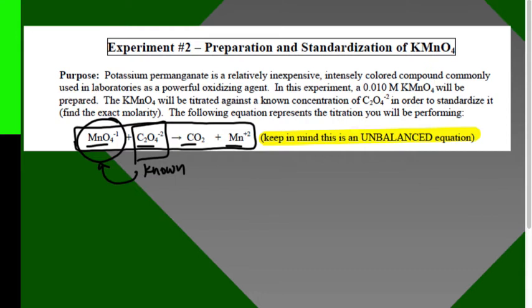In this titration, we have oxalate in a beaker that we've dissolved—a known amount of oxalate. In our burette we have our purple potassium permanganate. We're going to titrate the permanganate, and it's going to be weird because you're going to be putting purple in and it's going to turn clear. That's because the oxalate is going to reduce the Mn from +7 to +2.